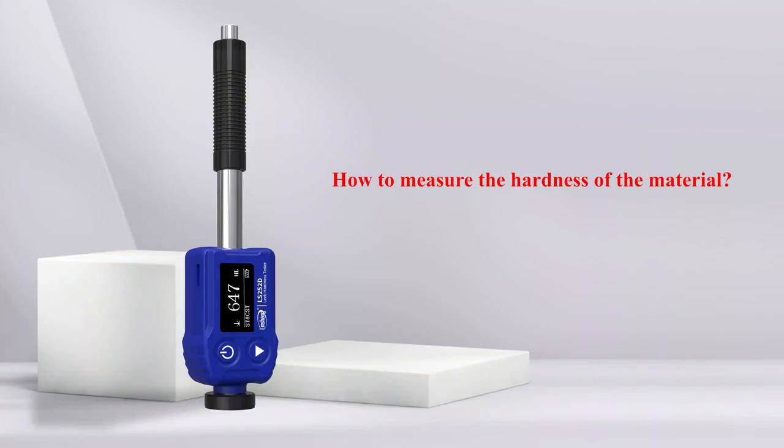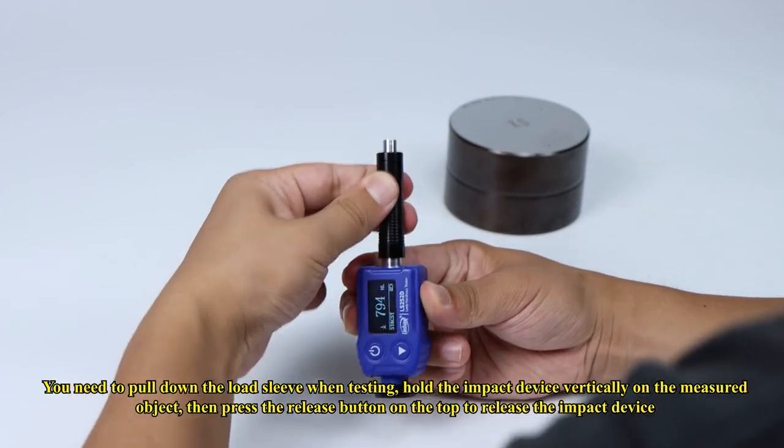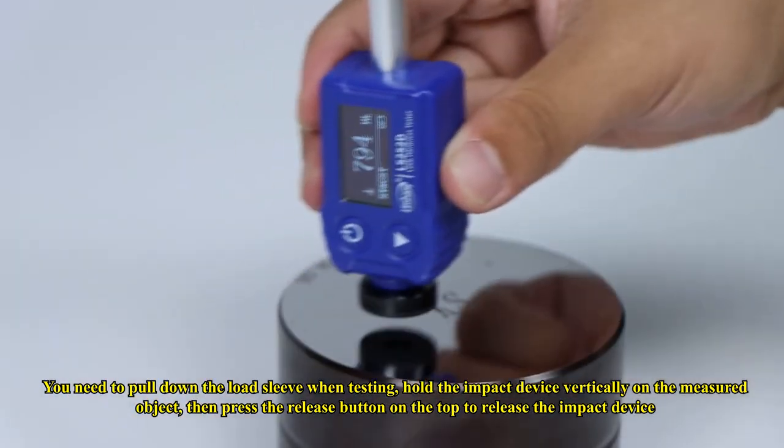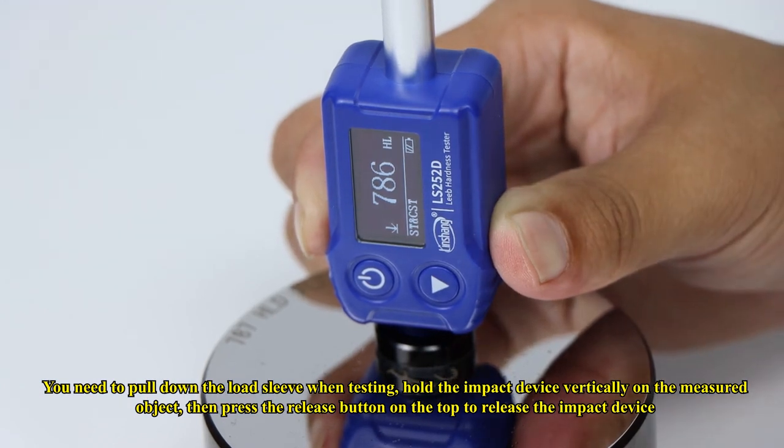How to measure the hardness of a material: pull down the load sleeve when testing, hold the impact device vertically on the measured object, then press the release button on the top to release the impact device.